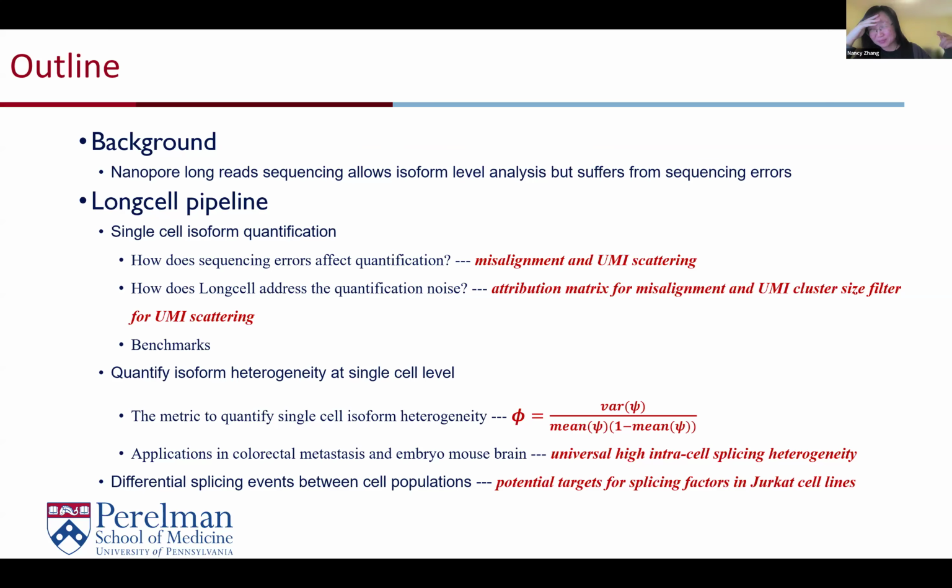In terms of why, one thing I don't know if this was true. We found that a lot of the intracell heterogeneity events we found were probably alternative 3' or 5' UTR, right? There was a lot of intracell heterogeneity in the last UTR usage. So biologically, what does that mean? I don't know. But I think it is important to distinguish between these two types of alternative splicing.